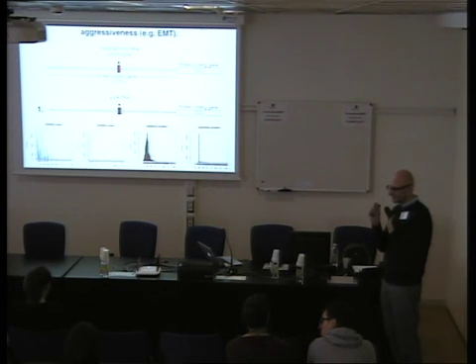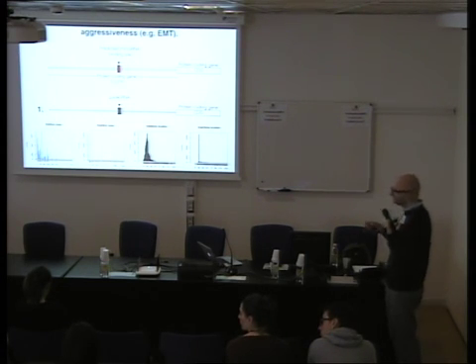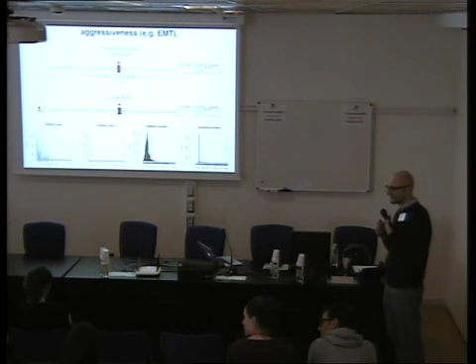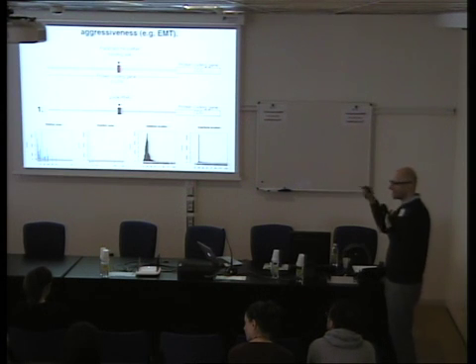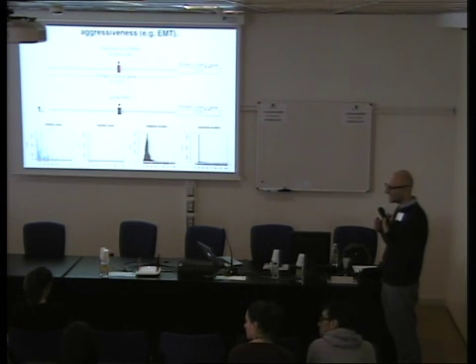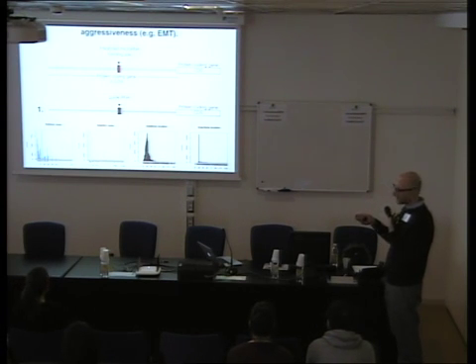Because you were expecting small ones, but actually it was reported that you can get big deletions. We are now generating more of this data. So these are like the first two that we got. And instead the insertions are mostly one nucleotide, you see?